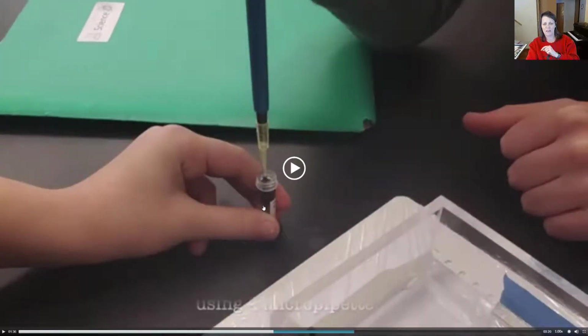These are the vials of ink that we are going to be using to draw from and filling the wells. You don't see the full picture of this micropipette, but there is a button on the top that you are going to be pressing and releasing in order to get this ink.